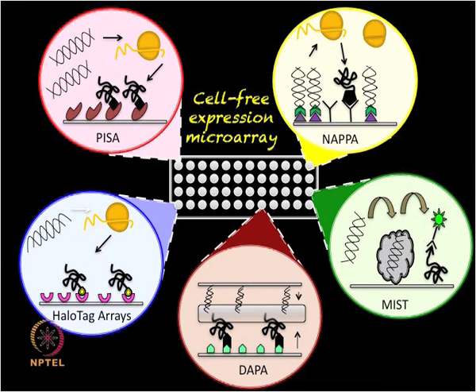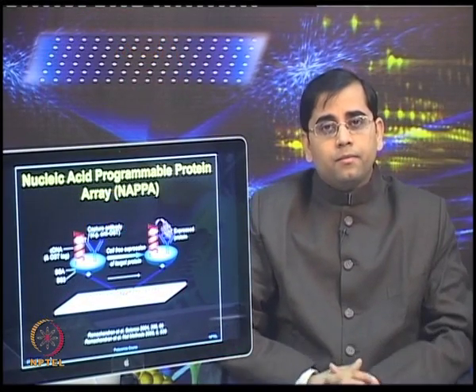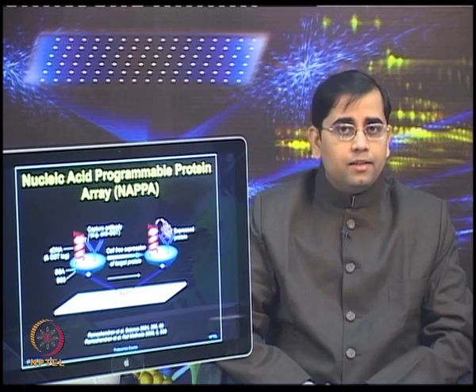Although each one of these techniques offers several unique advantages, the NAPPA approach has proved to overcome various limitations, and it is applied for very high density arrays. So, today I will focus more on NAPPA arrays. Just to refresh you about nucleic acid programmable protein arrays, which we discussed in the previous lecture.